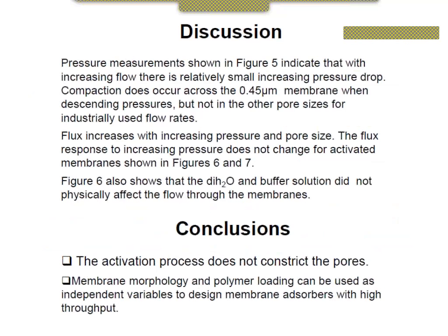So in conclusion, we can say that the activation process does not constrict the pores. And we can also say that from this data, we can use this to create a membrane adsorber that has high throughput.